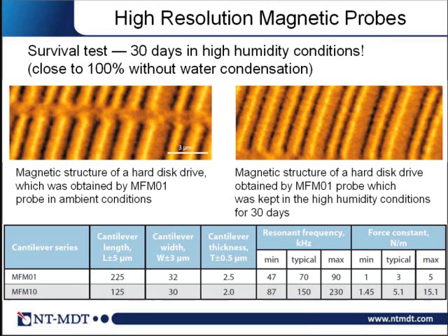For that purpose, one should use special probes, high resolution magnetic probes. And as you can see here, these cantilevers have different properties, but they can create really very good resolution, down to 10 nanometers, which is rather important. They are quite stable, which is also a problem in magnetic force microscopy, that the probes break.